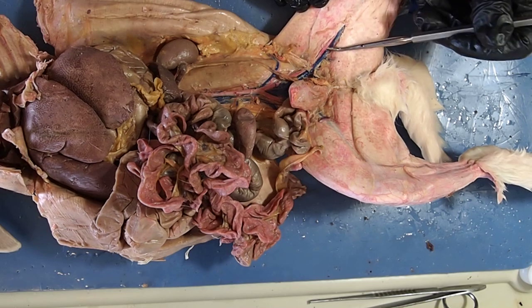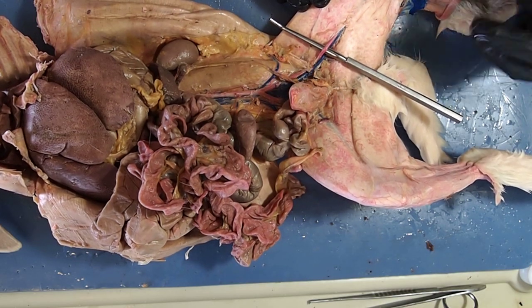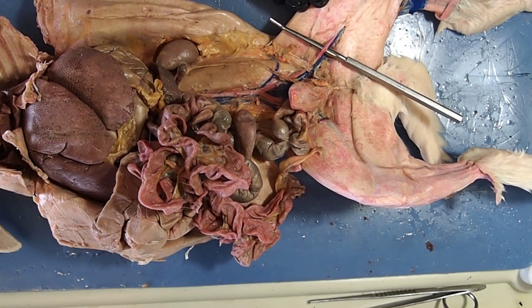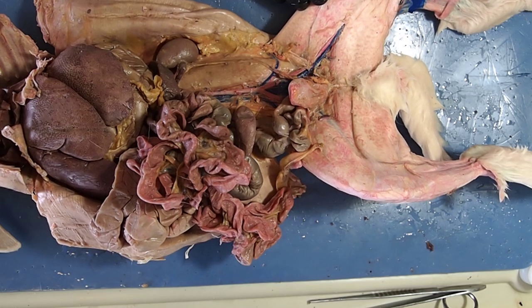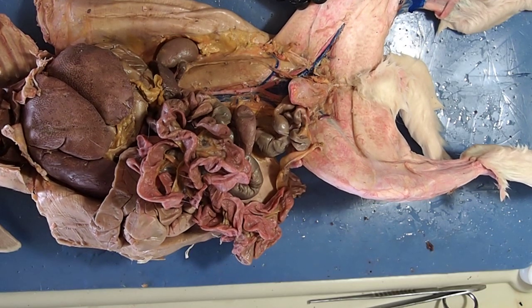That concludes the circulatory system of the rabbit and the dissection of the rabbit. Please refer to your lab documents as you look at these videos and the still pictures as well, because pictures from the rabbit dissection will show up on the lab exam.